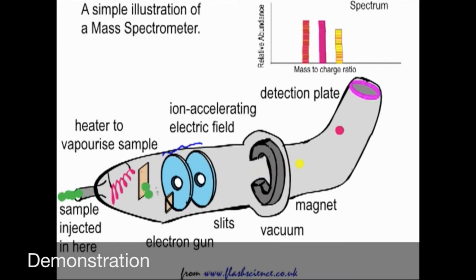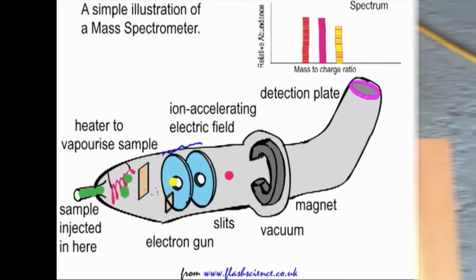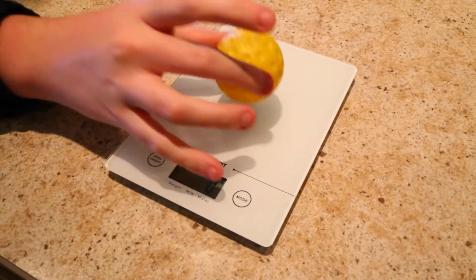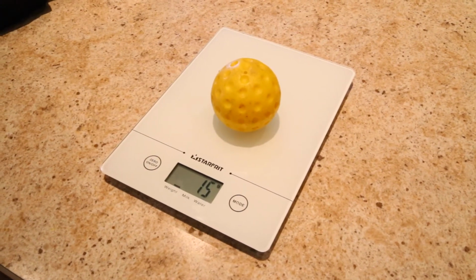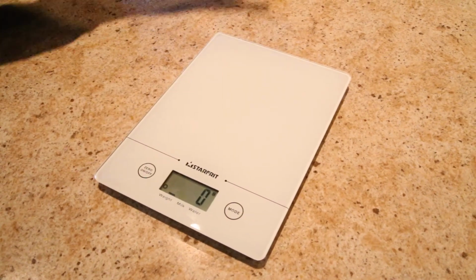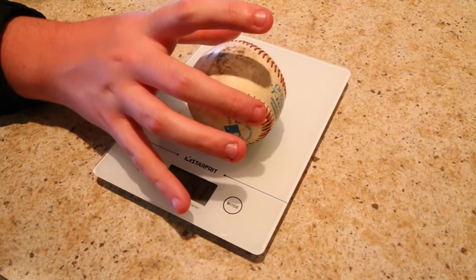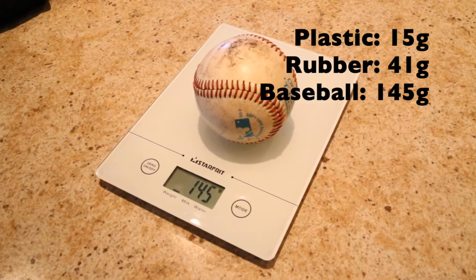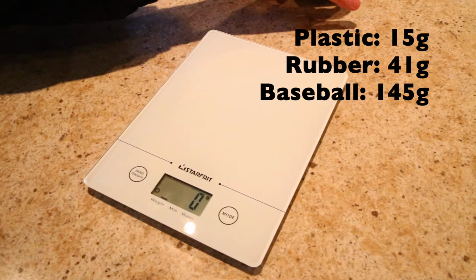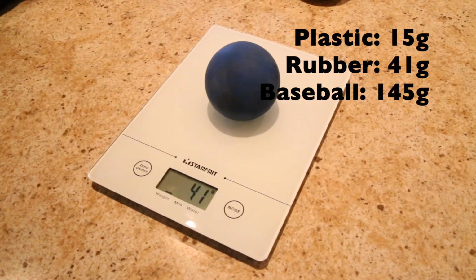To help you visualize what is happening in the mass spectrometer, we have created this demonstration. Imagine it like rolling a plastic ball, a rubber ball, and a baseball down a slope, and then deflecting them with an air blower. As you can see, the plastic ball was the lightest with a mass of 15 grams, the rubber ball was in the middle weighing 41 grams, and the baseball was the heaviest weighing 145 grams.